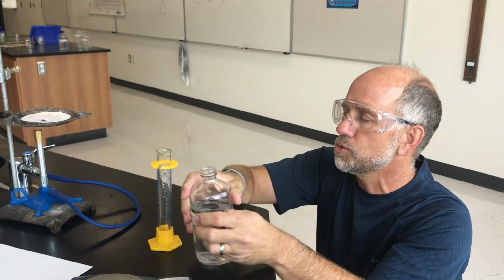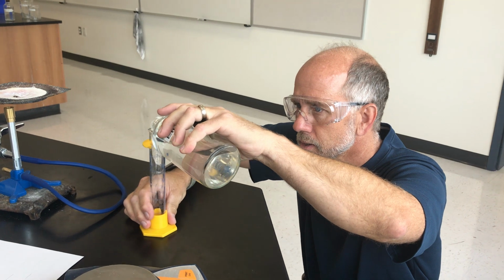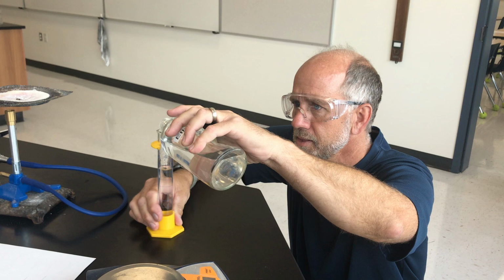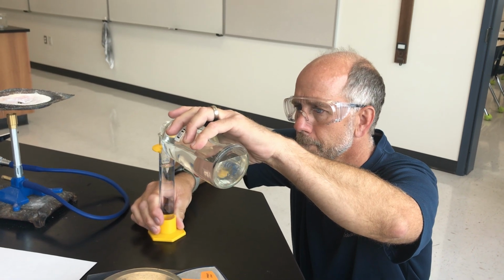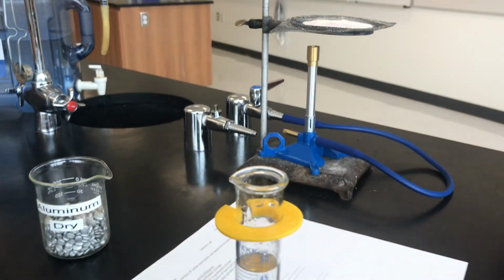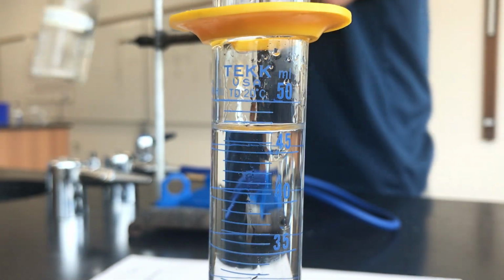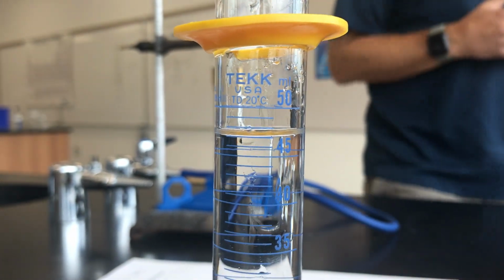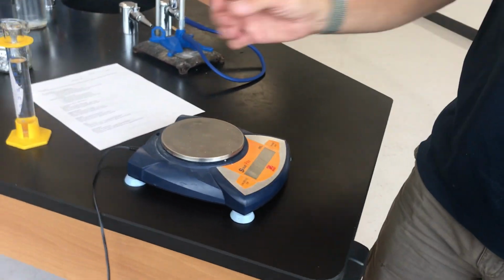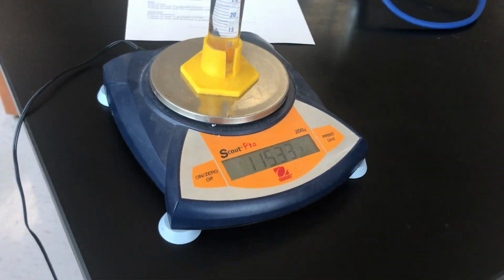Remember that when you do this, you want to palm the lid, and we will dispense an amount of ethanol. I think we can go a little bit more. We'll stop there. Again, following the instructions, we will read the volume of that ethanol sample. And then we will re-zero the balance one more time, and we will read the mass of the graduated cylinder plus the ethanol.